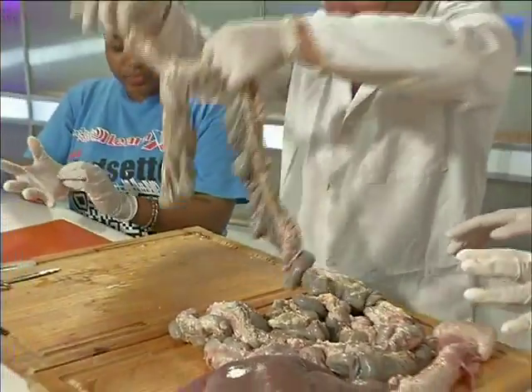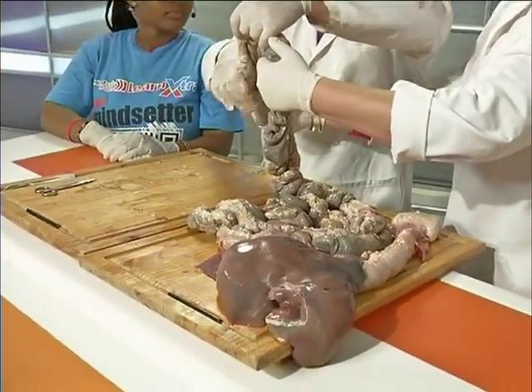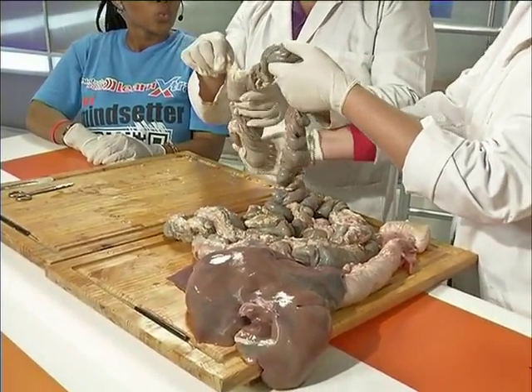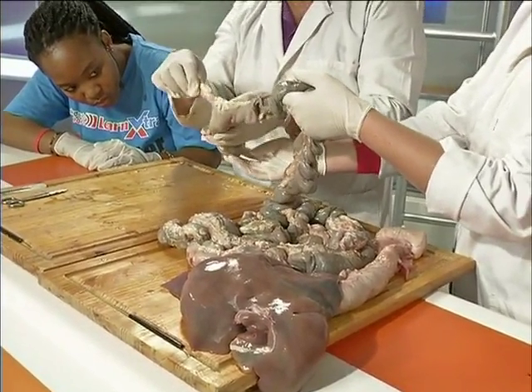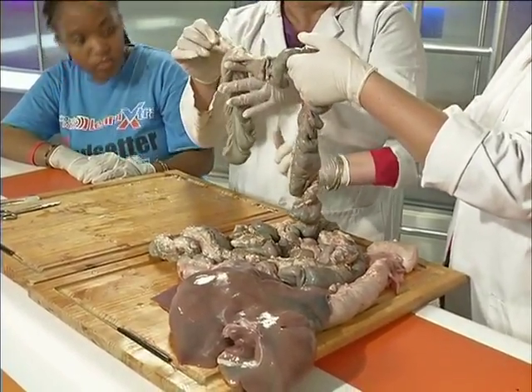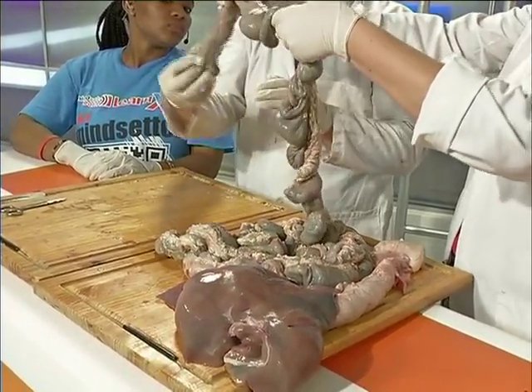Now we've got the large intestine. Let's have a look how large it is first. Is this the, what do you call that thing? People get infected and then they have to have it cut out? The appendix. Or is that in the small intestine? The appendix is just after the small intestine. So is this the appendix? Because it goes the wrong way. It does, doesn't it? Here's the pipe and then you've got this little bit. So I'm guessing that's the appendix.